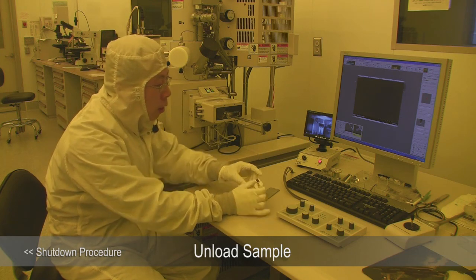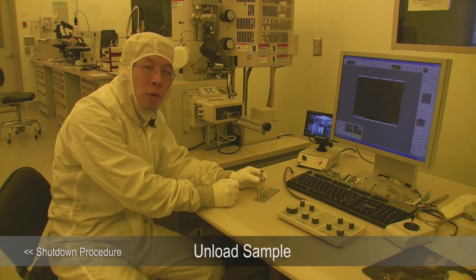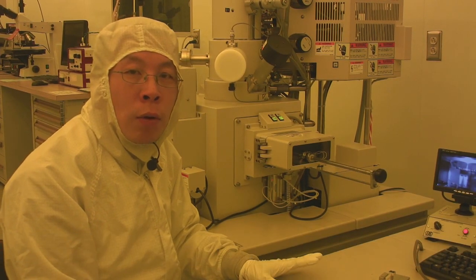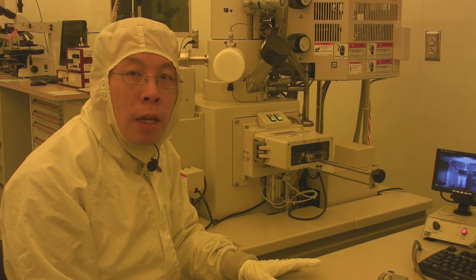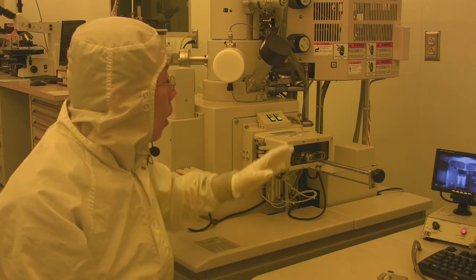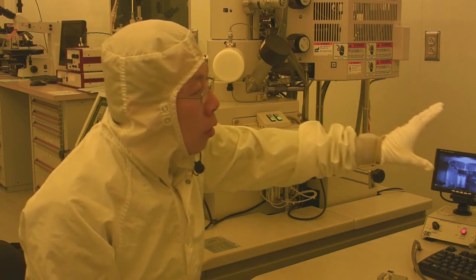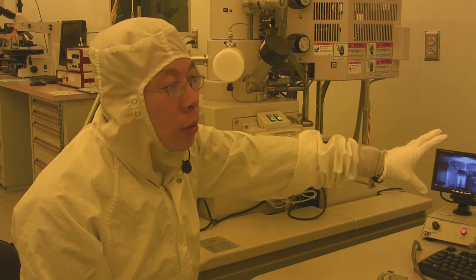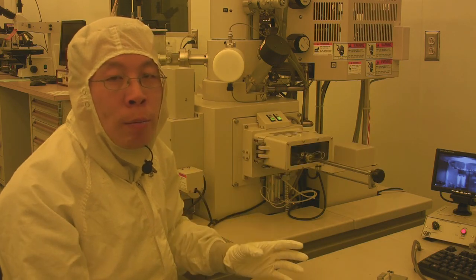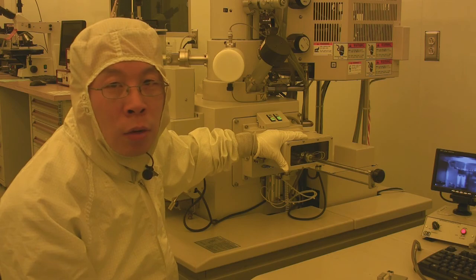Then you can take your sample off the carbon tape and put it back in your sample holder. So I've just shown you how to use the Hitachi S4800 scanning electron microscope to inspect a sample, including loading the sample, adjusting the focus to get a good image, using the software to measure the dimensions of your sample, and finally how to shut down and unload the sample.